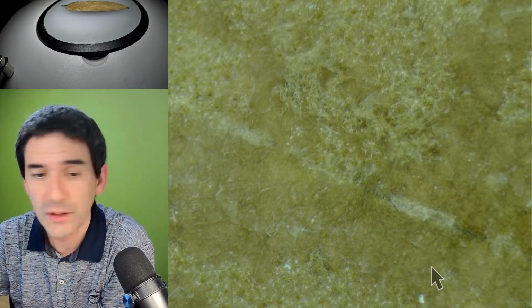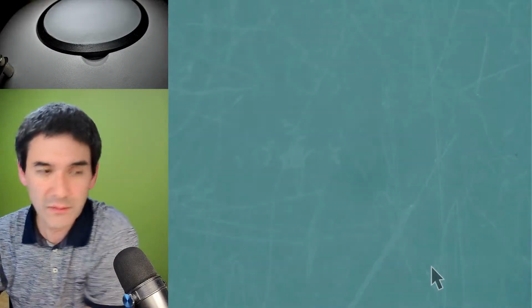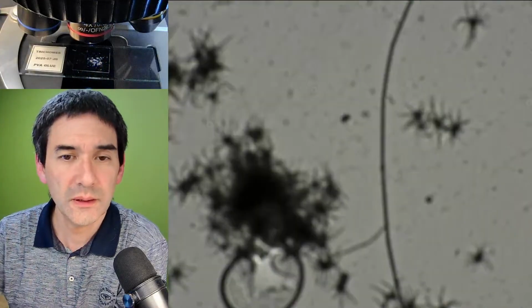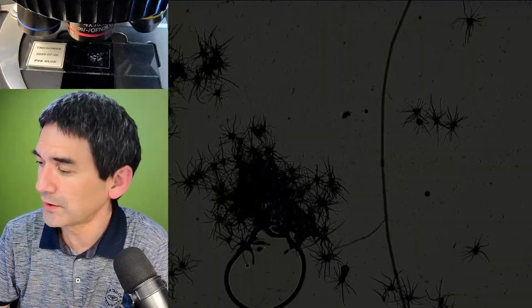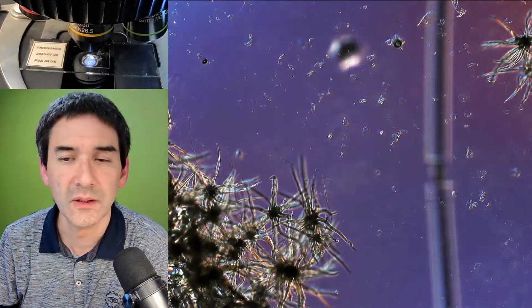So I just wanted to show that to you, and that is something that I simply took and put on a microscope slide, and where is it? Here it is again. Yep, that's a regular bright field again. And if you want to see it a little bit with color, then we have to switch on the other filters here. Here we go.